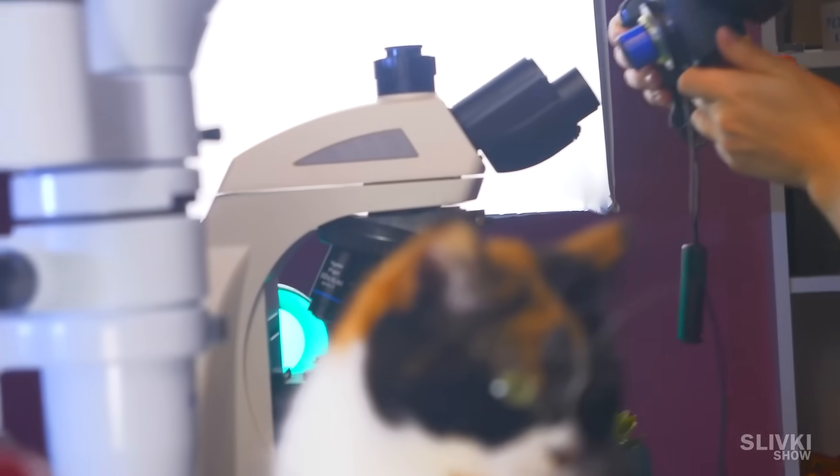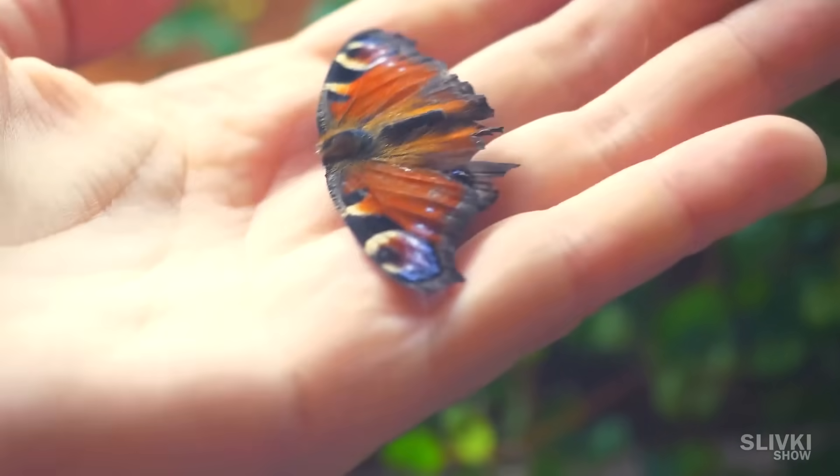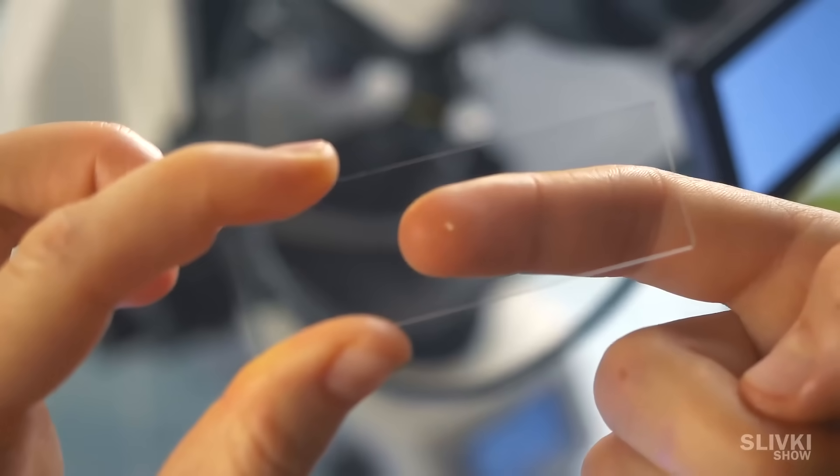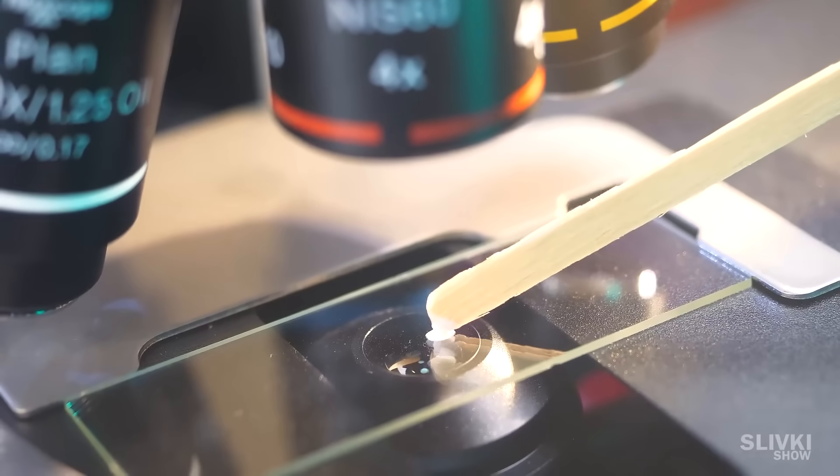Hi, today we are going to find out what a human hair looks like under magnification, a butterfly wing, the beauty of a human pimple, and does yogurt contain the healthful bacteria promised by the manufacturer.